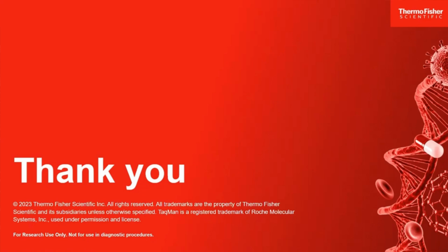So the CT has an inverse relationship to the number of molecules of the target you started with. The smaller the number of target molecules in the reaction, the longer it takes to amplify to the point that you start to see signal emerge from the baseline. Conversely, if you have a large number of target molecules, it will take fewer cycles, so the CT will be smaller because it took fewer cycles to generate that level of signal.